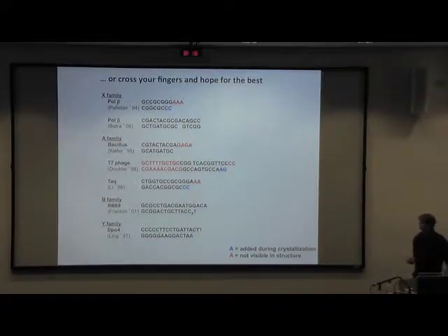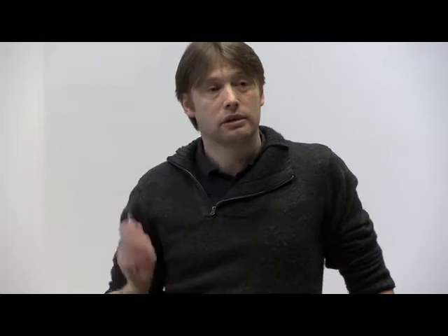So there's no way you can sit down and think about it. I'm going to use 24 nucleotides and a 3 residue overhang, and that will give me crystals. Here, in this case, this is pure luck, especially if you think about this one where you have half of your DNA substrate not even visible. Logically thinking, you would never have done it. In some cases, you just don't know what to do.